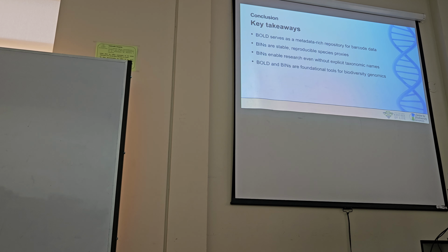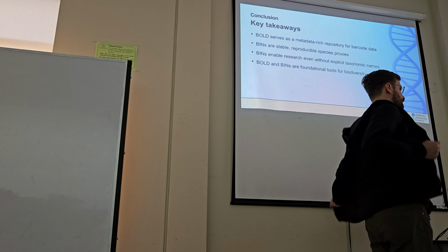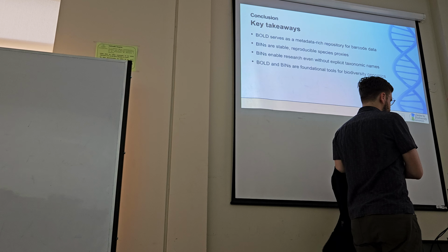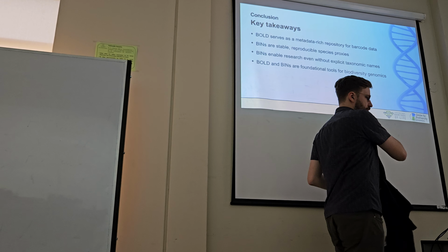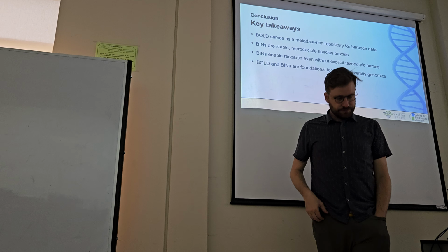But if there's a 100% match, there may be more than one species with the same sequence, so it would give you a slightly lower probability that it's that species, if that makes sense. We can explore this in the course as well. And then maybe it would give you 100% confidence at a higher level, like a genus or a family. Maybe it doesn't have any exact matches, but it has a lot of close matches which are all in the same genus or all in the same family. So that's where it would give whichever it has the most confidence.